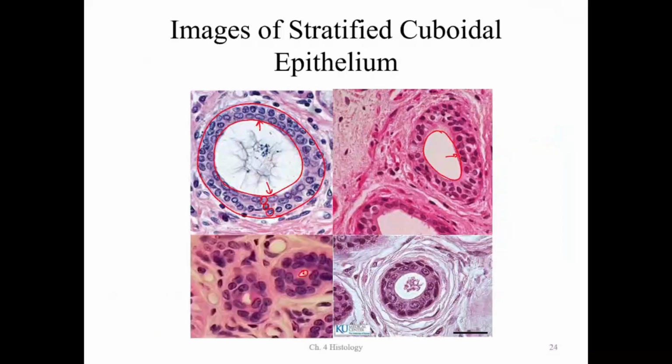Free surface right there, 2 or 3 layers. 2 or 3 layers of cells. 2 layers of cells on this one. Right, that's what you're looking for.